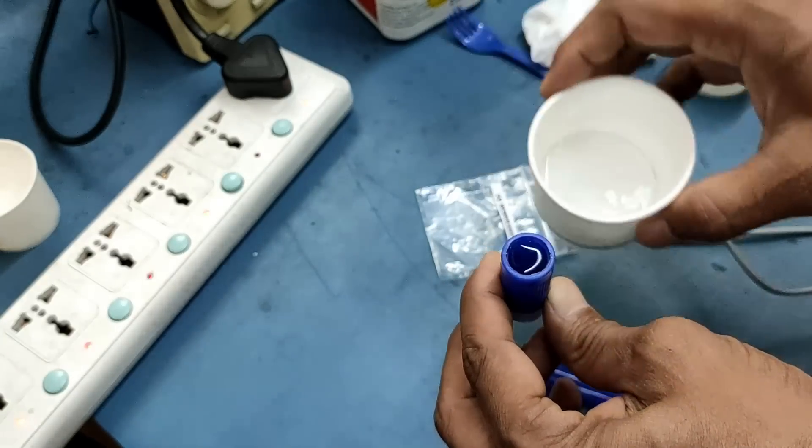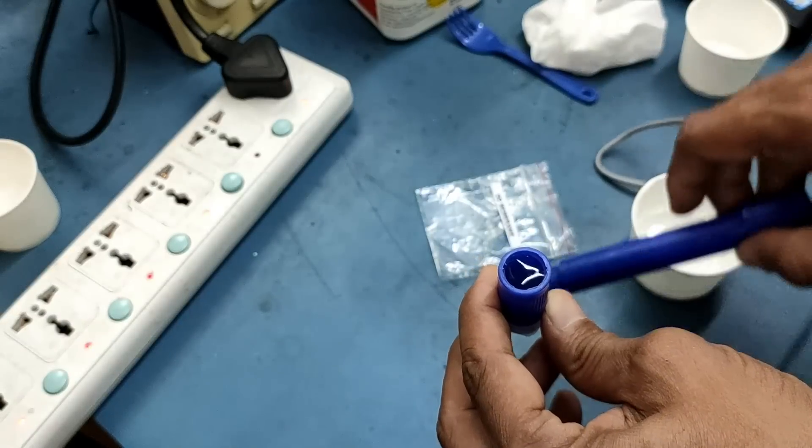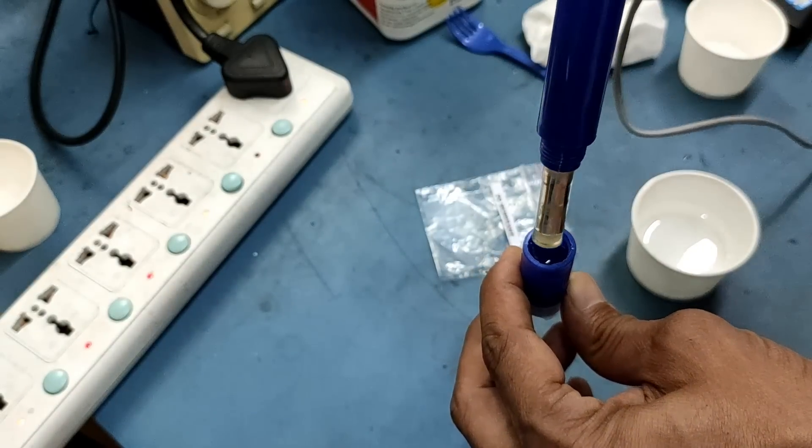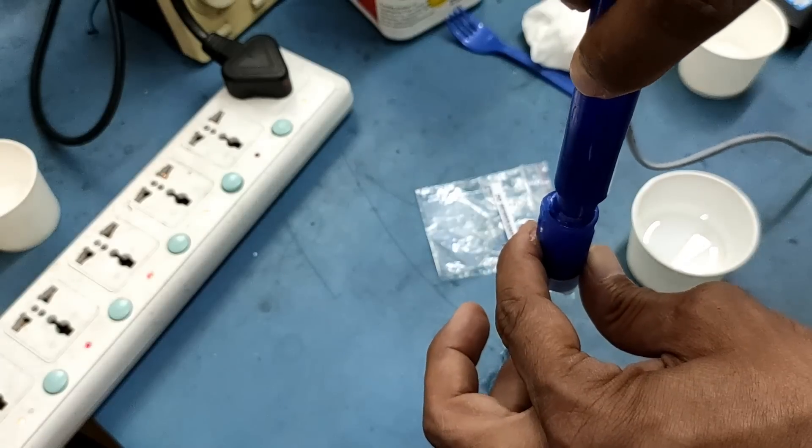It would be nice if a little bit of solution overflows out of the cap to ensure the probe is fully filled with KCL solution and there are no air bubbles in it. 7.5% KCL solution acts as good electrolyte in D.O. probe.